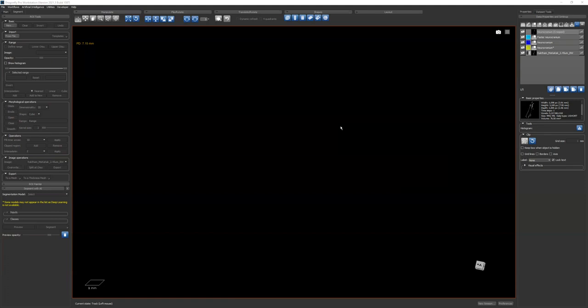It doesn't matter in the end, I don't think. But if this is a mistake that I'm making in exporting these, or if this is really the reality of the data, I'm just not too sure about that. So the original TIF stack was in transverse, right, in cross section. There's no original TIF stack. Oh, okay, somewhere else. Yeah, I wonder if you can select the plane. I haven't figured that out yet. So if anybody figures that out, that would be helpful.